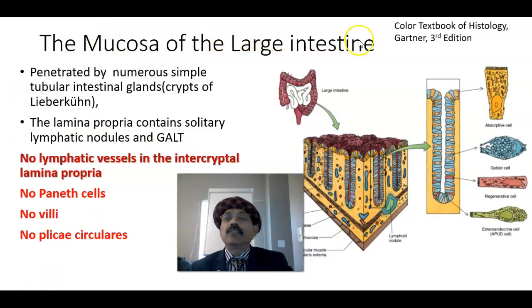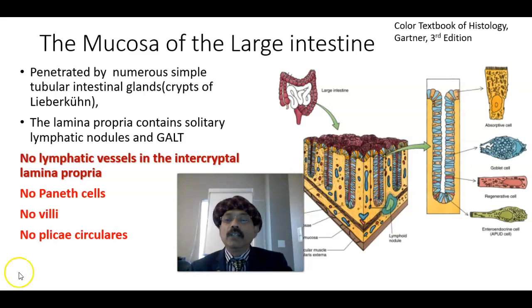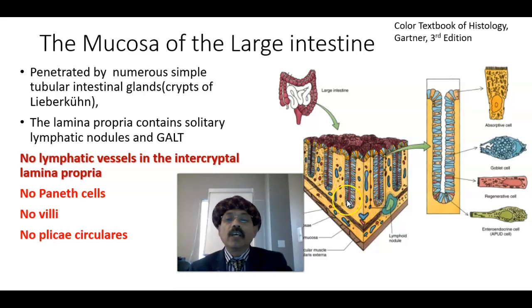The mucosa of the large intestine is penetrated by numerous simple tubular intestinal glands called Crypts of Lieberkühn. This is the intercryptal space — there is no lymphatic vessel there. The large intestine is different from the small intestine because there is no Paneth cell at the base of the Crypts of Lieberkühn. Paneth cells are only present in the cecum, but in most of the large intestine the Crypts of Lieberkühn have no Paneth cell. There are also no villi and no plicae circulares in the wall of the large intestine.